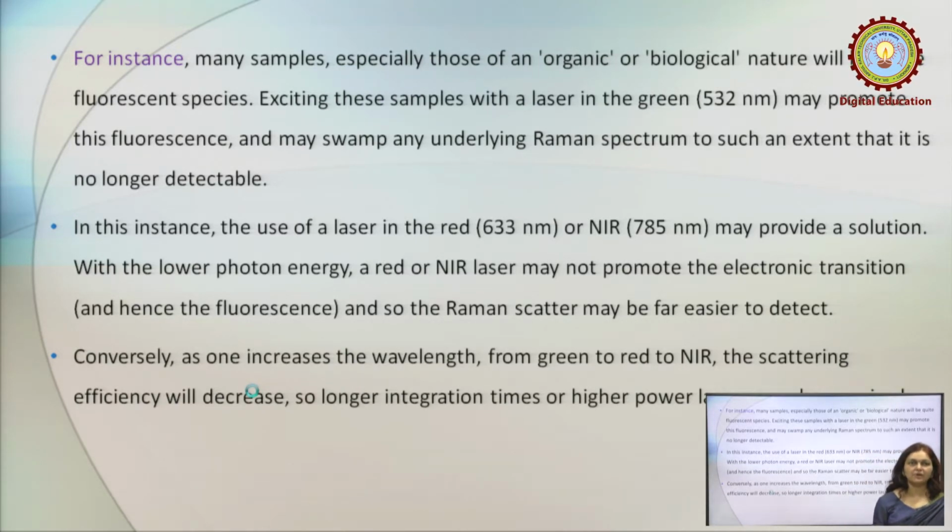Exciting these samples with a laser in the green range, 532 nanometer, may promote this fluorescence and may swamp any underlying Raman spectra to such an extent that it is no longer detectable.